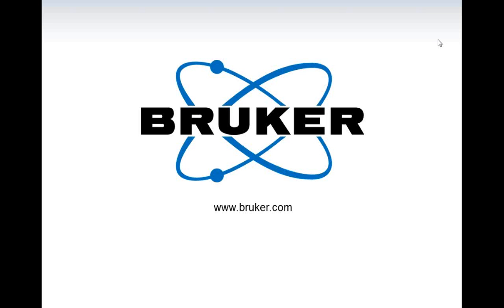So there was a follow-on to that SThM question. What resolution is that capable of? SThM is capable of detecting temperature variations down to a fraction of a degree, I would say, maybe 0.1 degree. As far as spatial resolution, the tip end radius on those probes is better than 100 nanometers. I'd have to look it up, maybe better than 50 nanometers. Not quite as sharp as a normal AFM probe, but it comes close.